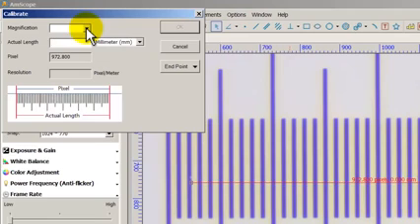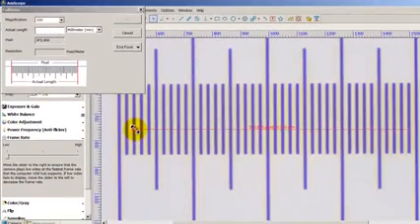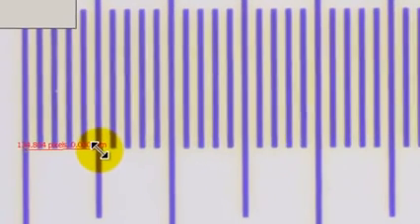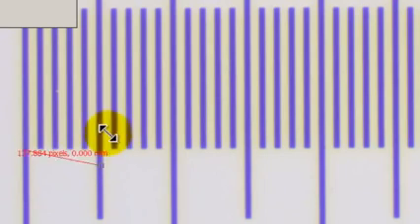So for magnification box, I'm going to choose 10. And the actual length again, this is in millimeters. So you do have to grab the red line from one end and place it as accurately as possible on the micrometer stage, or micrometer slide, whatever you want to call it. And again, this is all in 0.01. So 1, 2, 3, 4, 5, and that's 0.05. So I'm going to make sure that this red line is as straight as possible. Make sure there are no breaks. You see all those breaks right here.